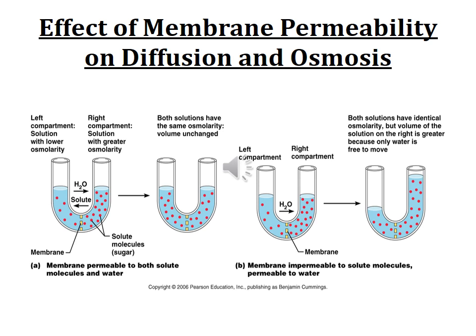On the far right side, this is the end result where you have the same concentration, the same osmolarity, but you can see here the volume is more. There's an increased volume on the right side. We have the same concentration but different volume, because water has moved by osmosis from the left side to the right side.